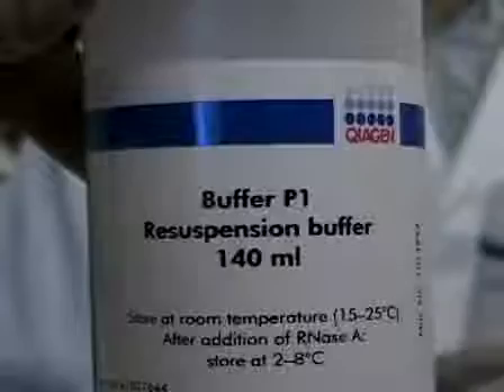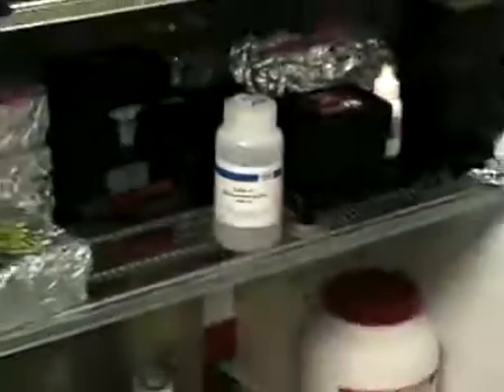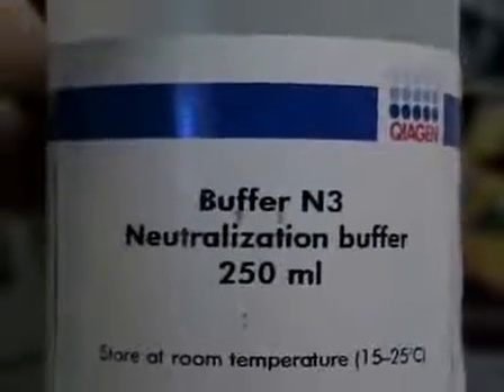There are three important buffers from the Qiagen mini-preparation kit: P1, P2, and N3. We normally put P1 at 4 degrees because it contains RNase. P2 we leave at room temperature. And for N3, we will pre-chill it just before the experiment.